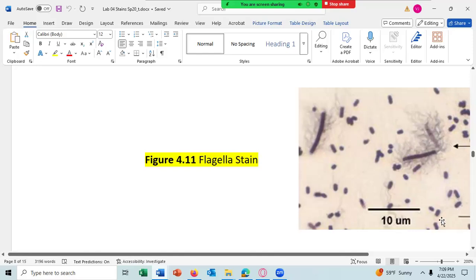So why do we have cells with multiple flagella arrangements in this picture? Anyone have a guess? All right. Well, initially, when the cell first divides, it will have no flagella, which might be that one or that one. And then the flagella will be made. Initially, the cell will put out one flagella on one end, which I'm having a hard time finding one here with just one. There's maybe one right there.